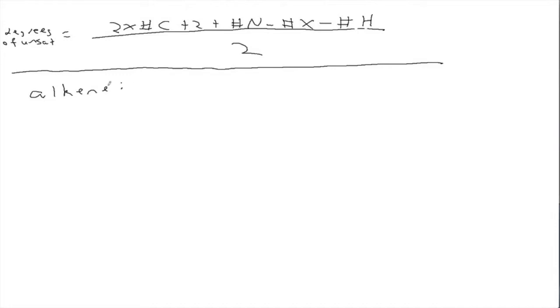Do you know where the alkene would appear in the proton NMR? Alkenes are, let's see, I don't have the values memorized. You don't need to have them memorized. Go ahead and use the table like you would on the test. Okay, so alkenes are 5 to 6. You'll see these terminal alkenes. Yes, so that 5 to 6 region, I'm going to write down as 4.5 to 6, because that's a little more accurate for the proton NMR spectrum.